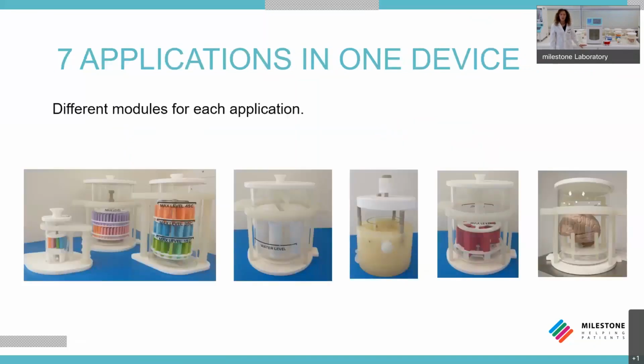How is it possible to perform all these applications in just one device? In COS, we use different modules. Each module is designed for a specific application. Now, I will show you these applications one by one in detail.